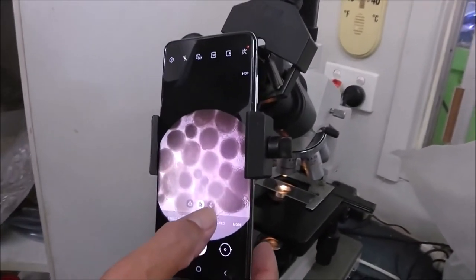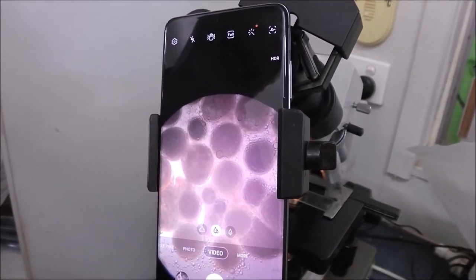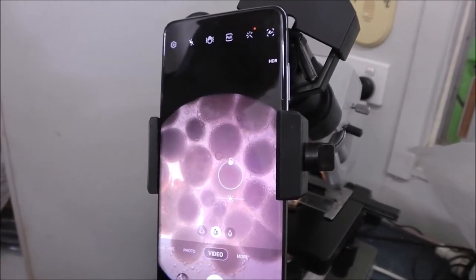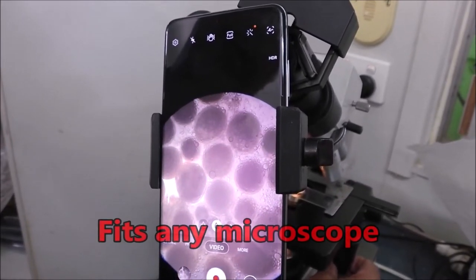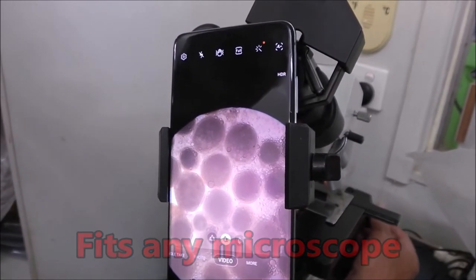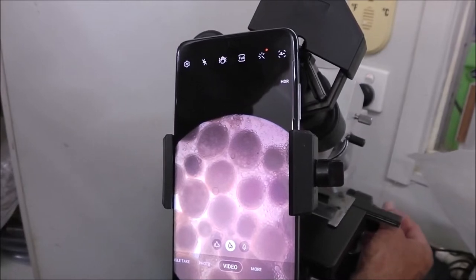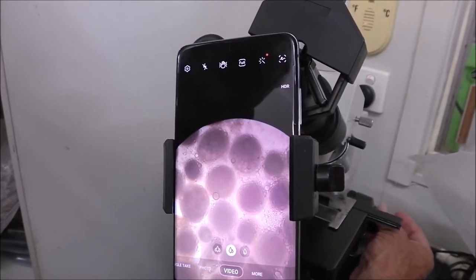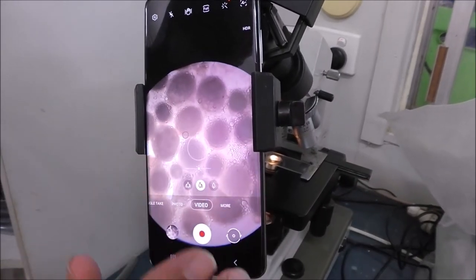And if you want to take a bit of video, tap on the video and then set your focal point, lock your focus, and then you can move around the slide and adjust the focus to zoom through the whole egg, because the egg's so large, only that now we're focused on the top of the water. Lock the focus.